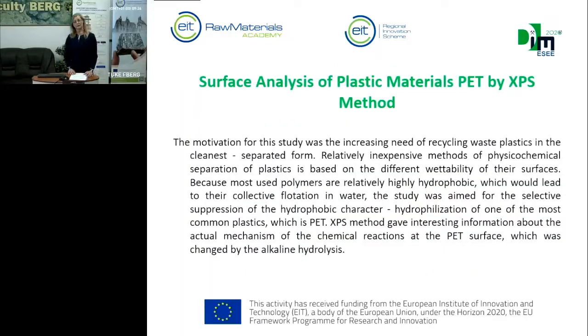Now, I would like to tell you something about our measurements, something about our investigation. We prepared several very interesting new and environmental materials and characterized them by the XPS method.